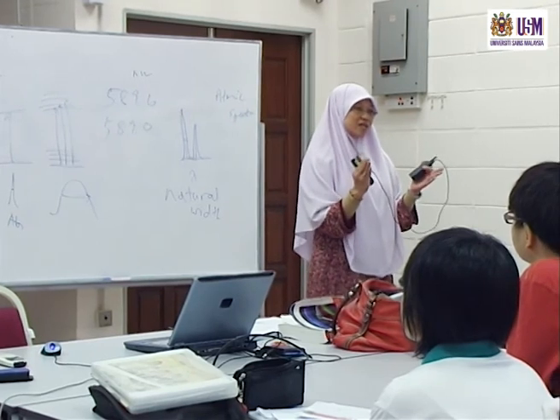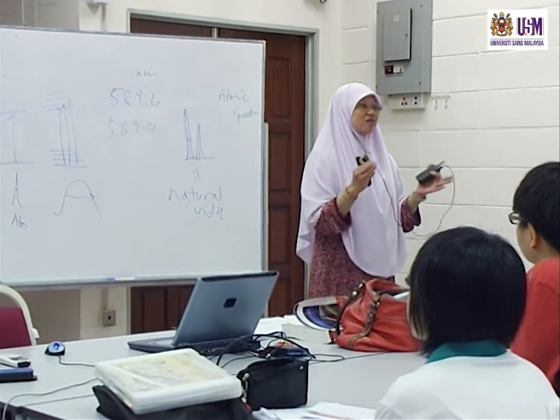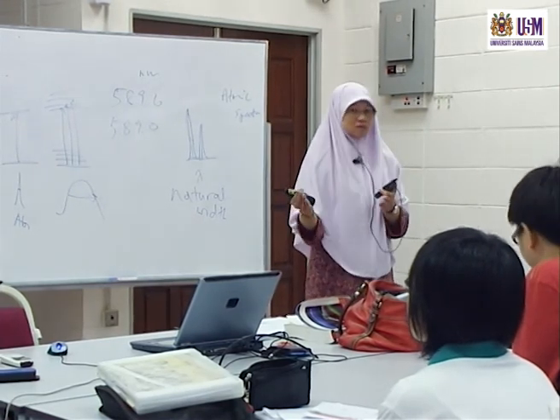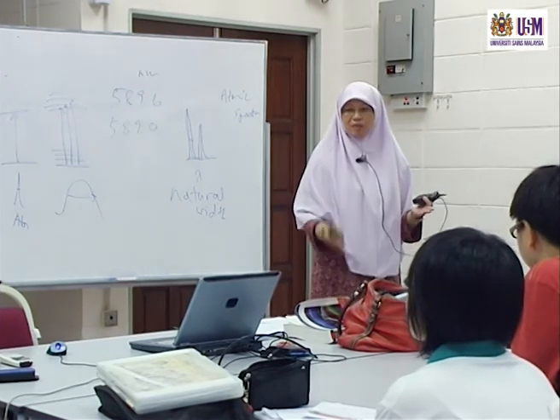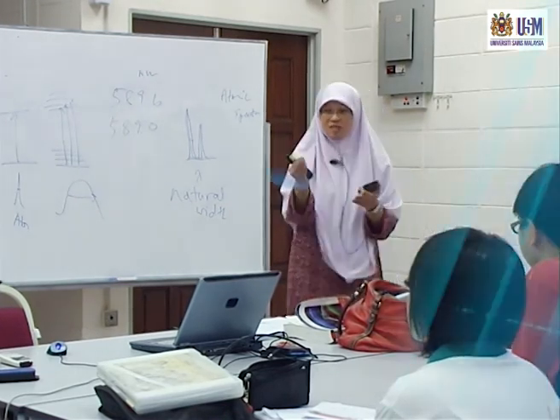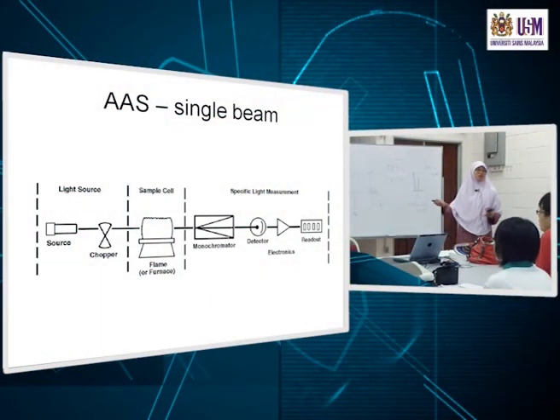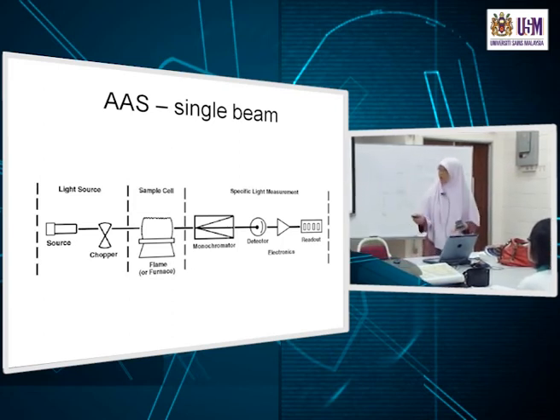Mention a specific technique, you know the basic principles, what happens, what is the theory behind it, okay? Then, the instrument, you must understand the instrument, because if something goes wrong, it goes back to something related to the instrument. So you must have an understanding of the basic components in the instrument, how it works. And then, of course, ultimately, application. So for any technique, those are the three things that you have to cover.